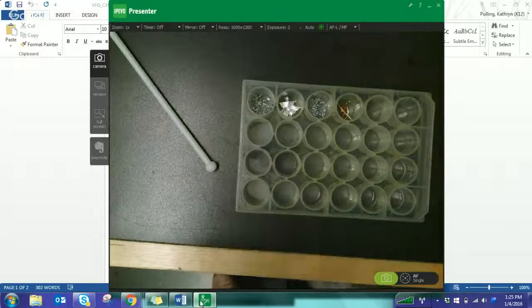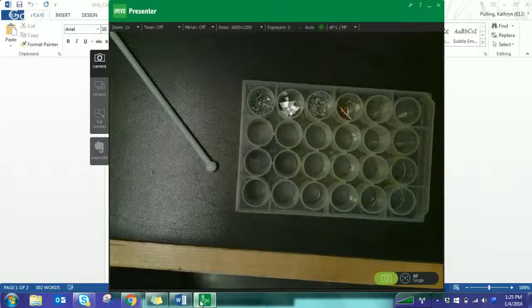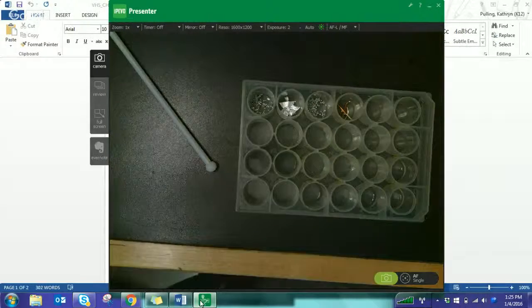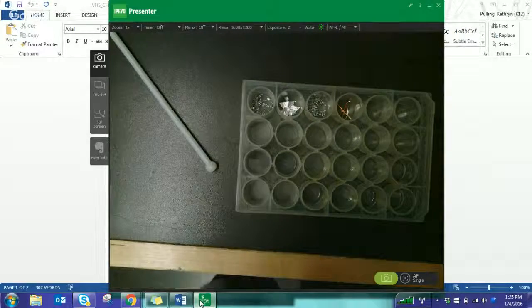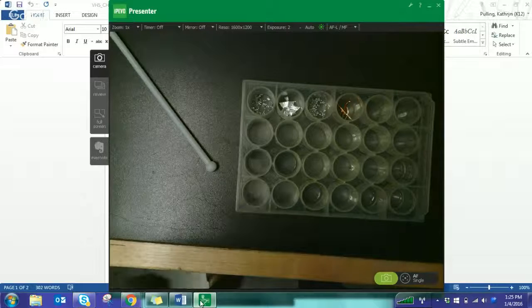Any sort of color change, something like that, is going to be what you're looking for. If a gas is given off, okay. We're not going to get a precipitate here because we're not starting from two liquids. But we'll keep going until we get a reaction. It says to ball up the aluminum foil so it fits in the microplate well. I just cut it in little pieces.